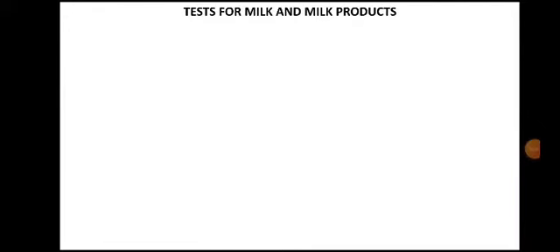In the practical course of MB 3507, practical course 1, that is applied microbiology 1 for first semester, we'll be discussing the different types of tests which are used for testing the quality of milk and milk product.